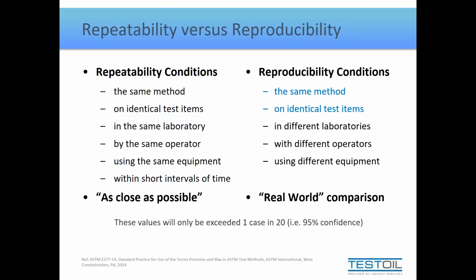One little extra note I'd like to provide is what we're going to take away from the values I'm about to show you. Though reproducibility really defines running the exact same sample 2 different times on possibly 2 different instruments, I'd like to equate reproducibility to what happens if we take a sample from a machine and achieve a value, and then a month later take a second sample from the exact same machine and analyze it.